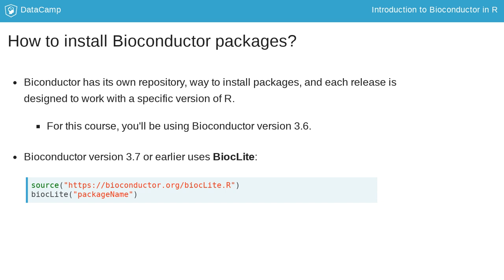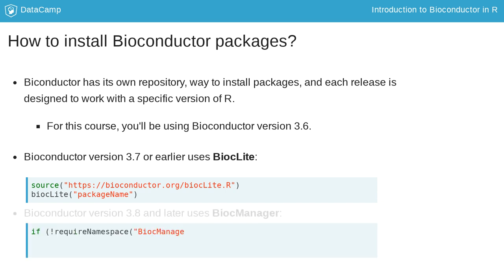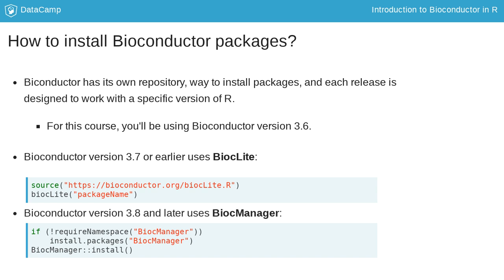Once you source the biocLite, you will be informed if any new versions of Bioconductor are available, and will also be shown a prompt to update your R version if needed. Updating packages regularly is important to get the new features. In case there are upgrades on packages or dependencies, you will be asked to update all, some, or none of the packages.